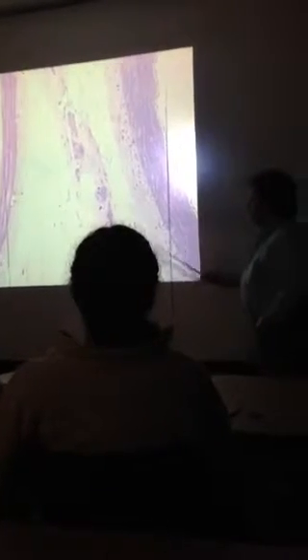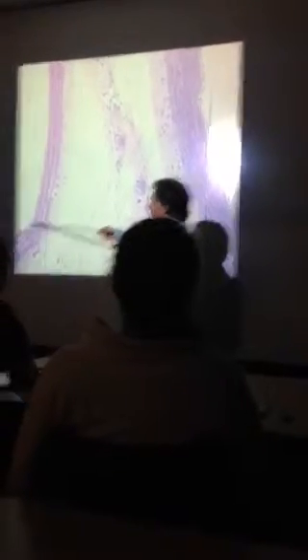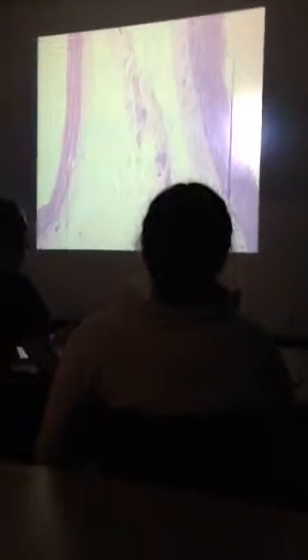Okay, so this would be probably a medium to a, I don't know, large. This really would be a large. It's probably a medium vein, and it's probably a medium artery. But you should know artery versus vein. Now, this is clearly a muscular artery.